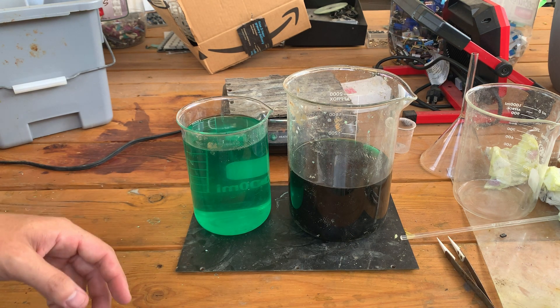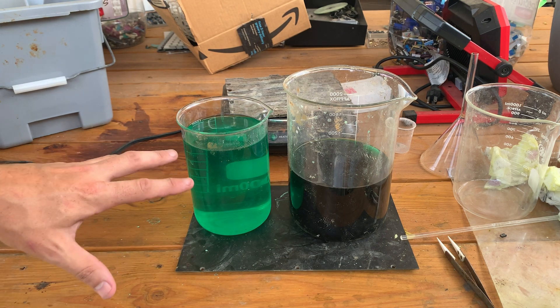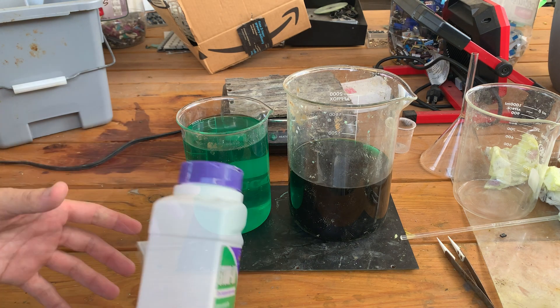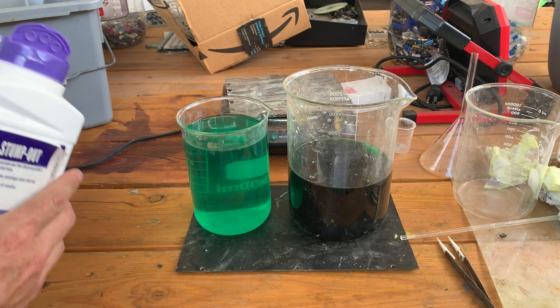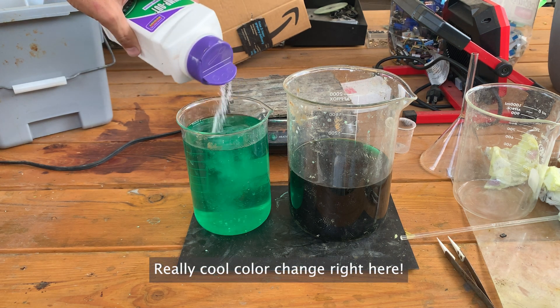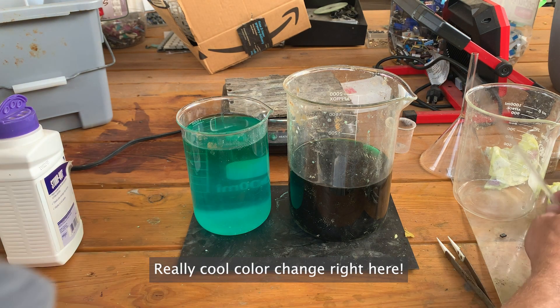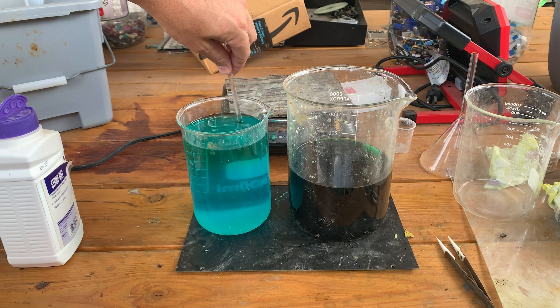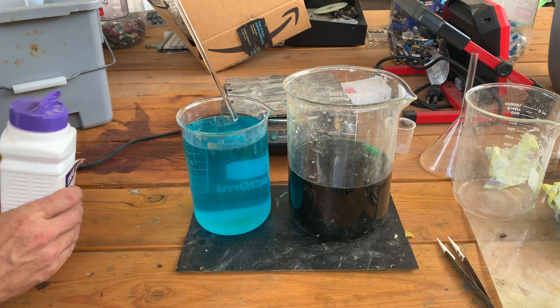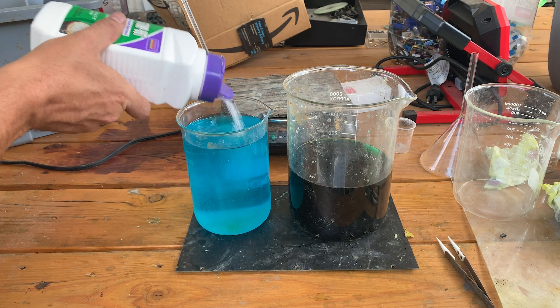I decided to leave these two beakers separated and drop the gold as-is. Mainly because I don't have a bigger beaker and I have too much fluid. We've got our stump remover and we'll sprinkle some in. I don't expect to see much in this one other than it just turned from green to blue — which is really cool. That is a really nice color blue.